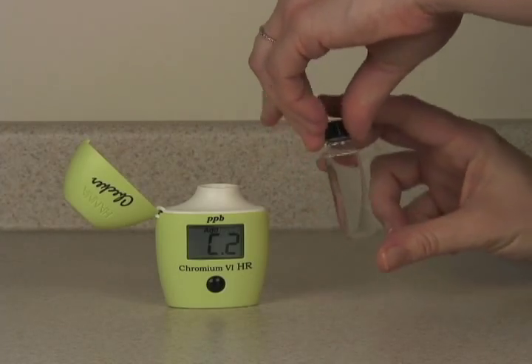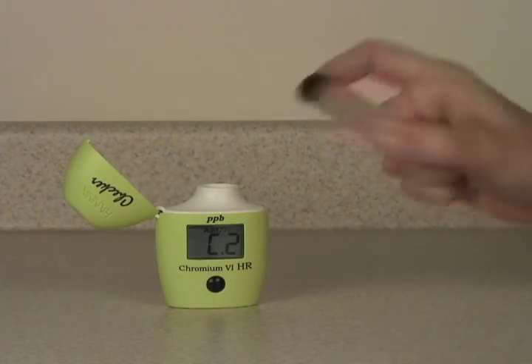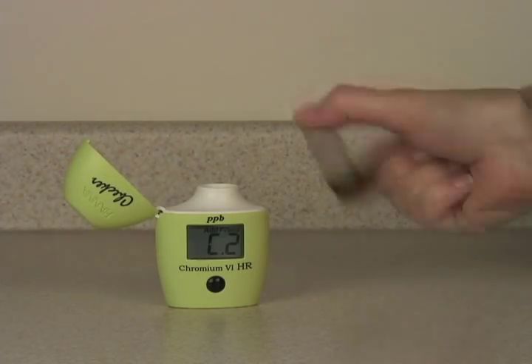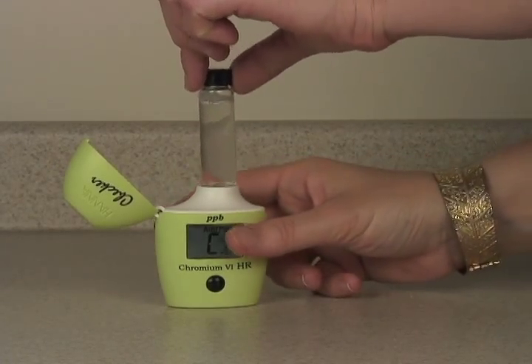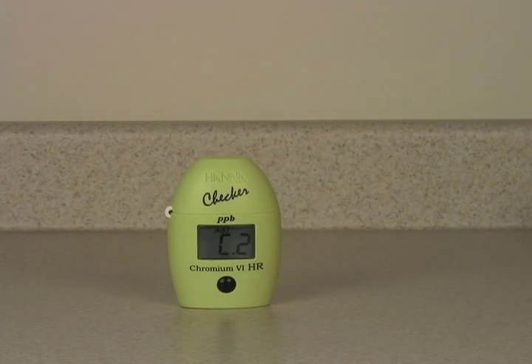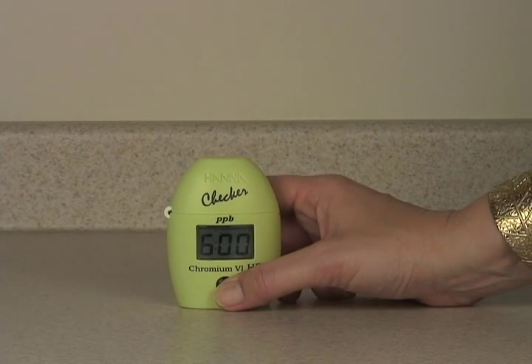Replace the cap and shake vigorously for 10 seconds. Put it back in the meter. Give it a few seconds to let the micro bubbles dissipate, and press and hold the button to activate the timer function.